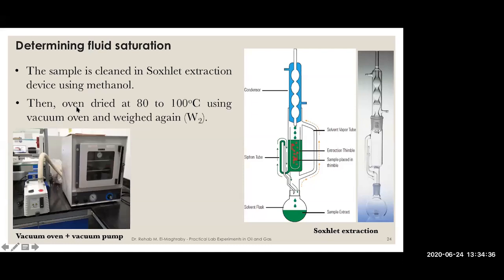So the boiling point of the water will be lower, like 60 degrees Celsius. So instead of being 100 degrees Celsius, under a perfect vacuum the temperature of the water will be like 60 degrees Celsius. Okay. So you now can evaporate any solvent at a lower temperature, which means that you are preserving your core, not damaging your core.